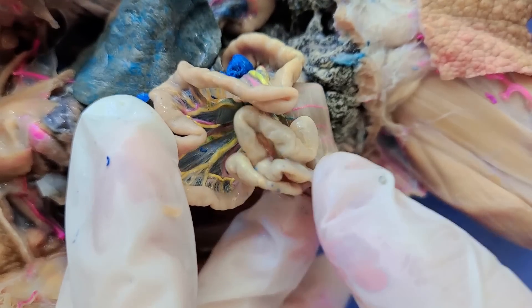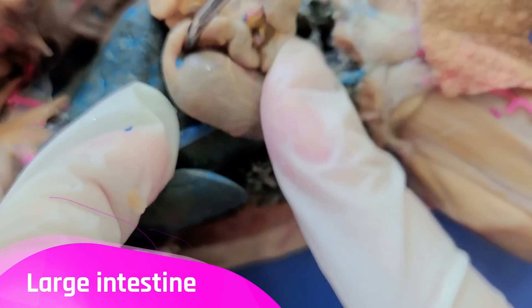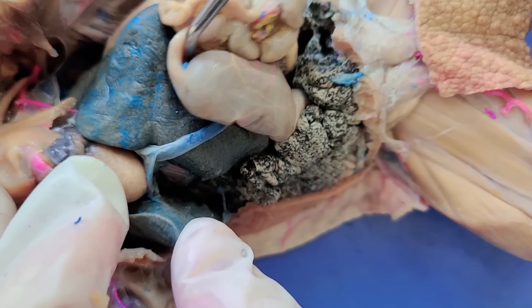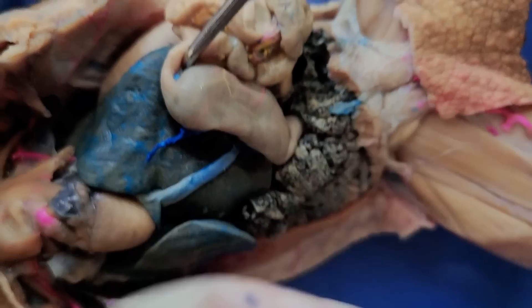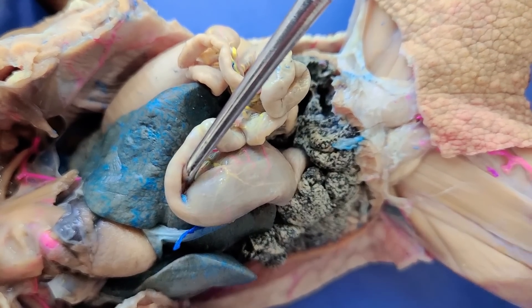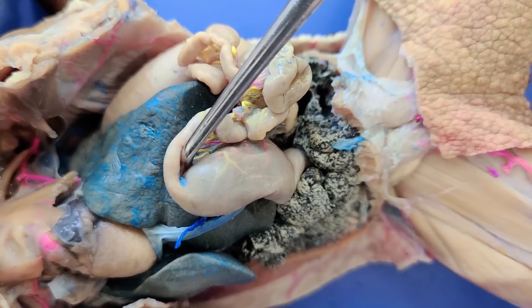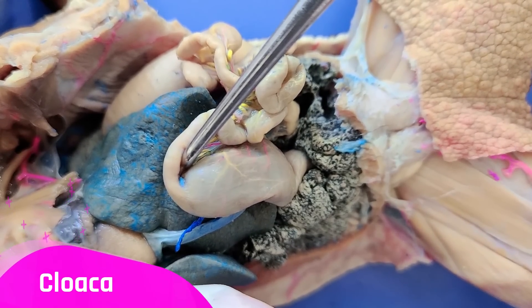Right after the small intestine, the food enters the large intestine. The large intestine is much thicker and shorter than the small intestine. This is where excess water from the food is absorbed and feces is made and stored until it can be excreted via the cloaca.